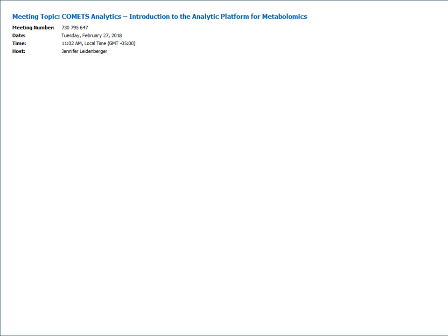So if a study of 1,500 samples is going out, you put these 30 samples in, you send the data from those 30 samples to a central repository, and as other studies run and they send more data to that central repository, you can start to compare metabolite levels across different platforms and different studies. That's the plan. Yes, thanks, Steve. Right now we have 30 samples in-house. There will ultimately be 40 samples. So Steve's numbers were right on.